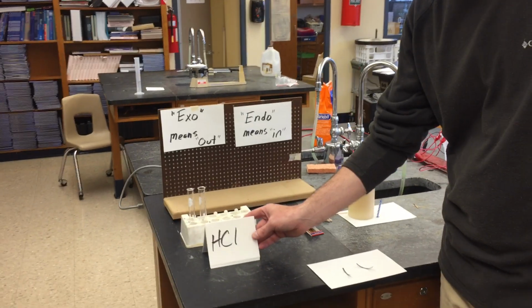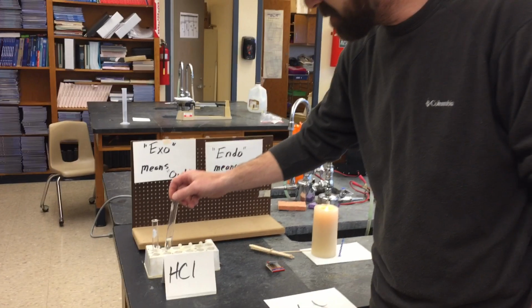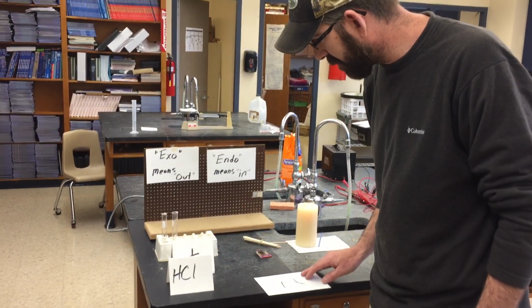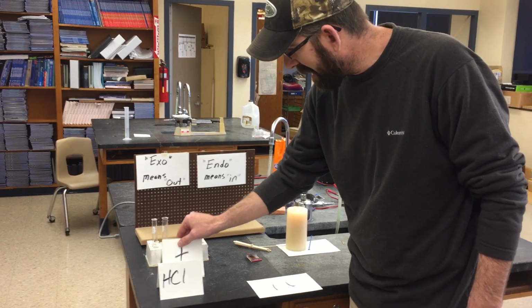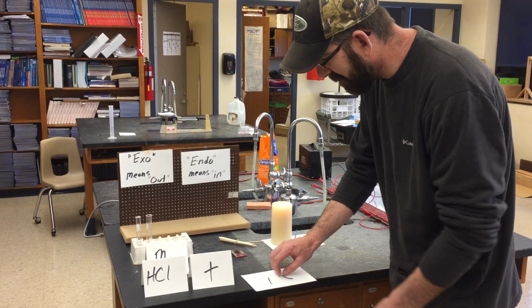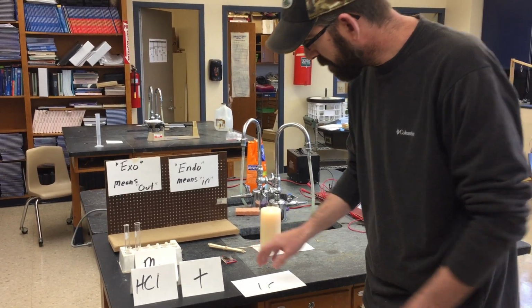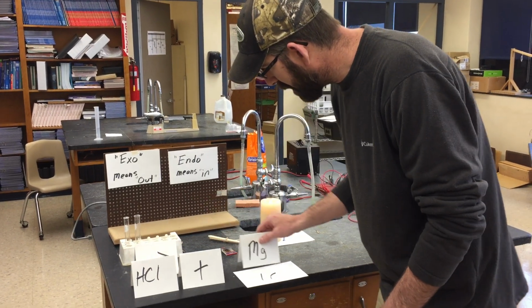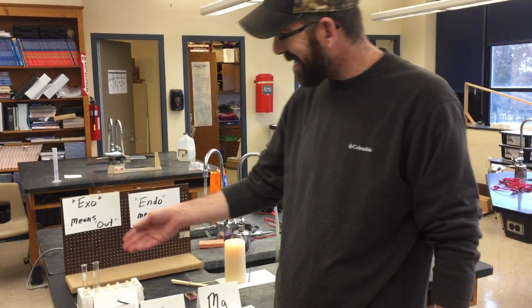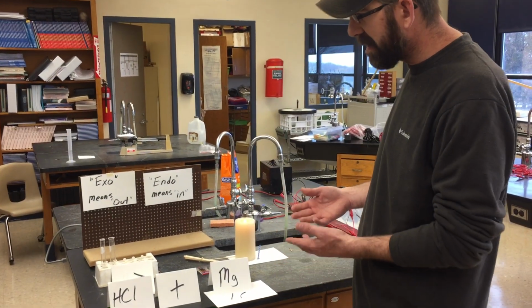With the reactants on the left side of the experiment here, we have ourselves some hydrochloric acid in these test tubes. So that will be the first reactant we have in this particular phase here. And we're going to add something to that acid, and that's going to be magnesium ribbon. You should remember magnesium ribbon from earlier here in this chapter. So we're going to pull that Mg out there, and so far now we have our reactants. Once we put that magnesium ribbon into the acid, a chemical reaction will take place, heat will be produced.